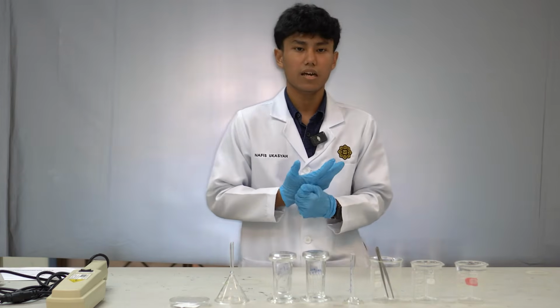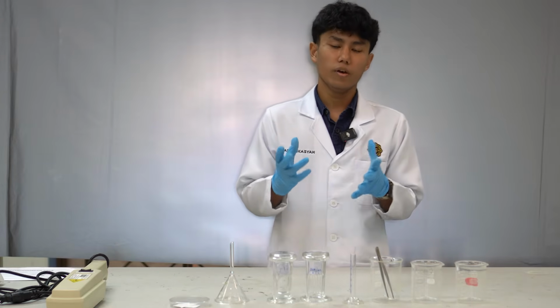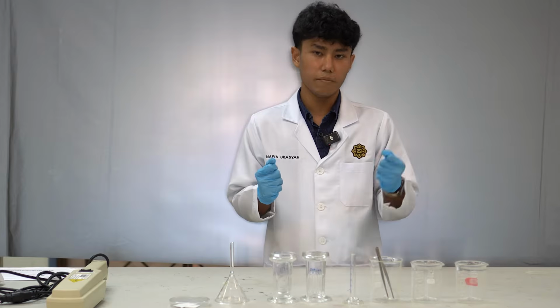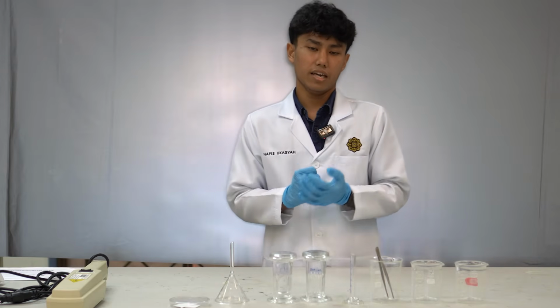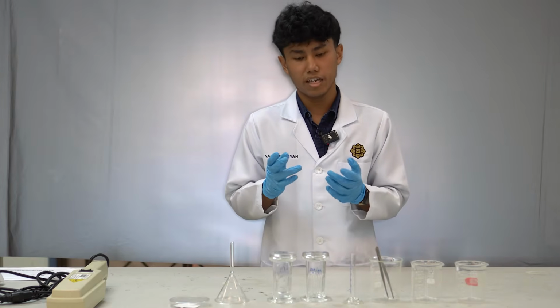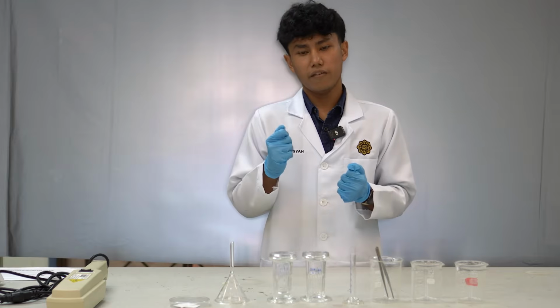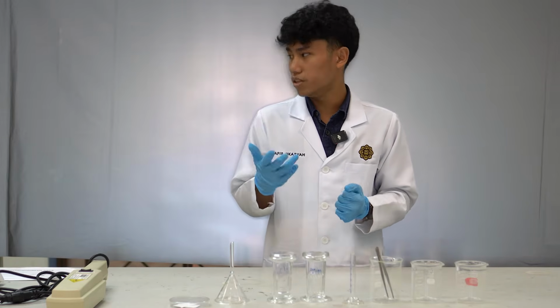Lastly, after we do the experiment, we need to dispose of any chemical solution and the TLC plate into the right container. It must be done to prevent contamination and fire hazard. Okay, that's all from me. I will pass to the next presenter.